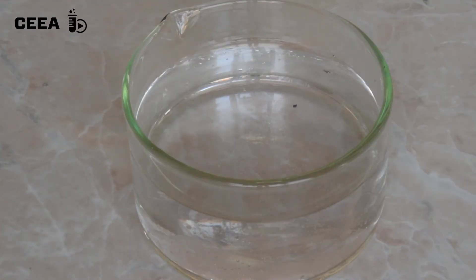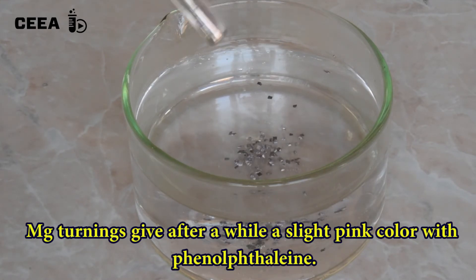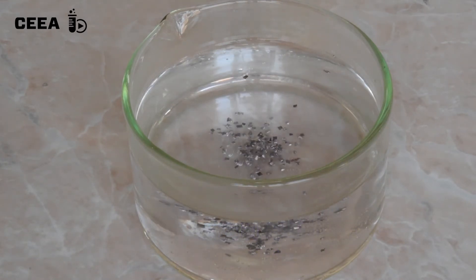If you do the reaction with magnesium turnings, a slight coloration of the phenolphthalein is observed after a few minutes, only around the magnesium turnings.